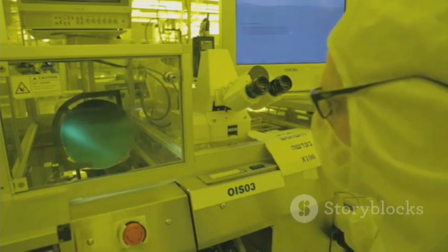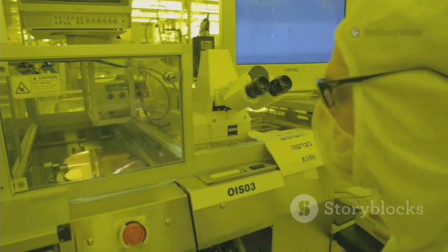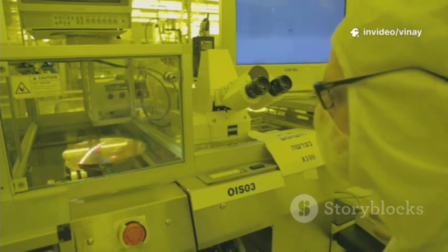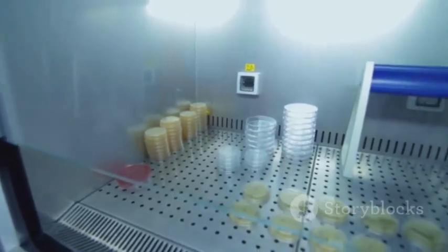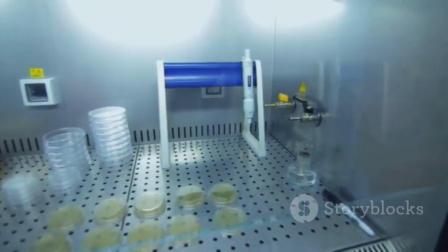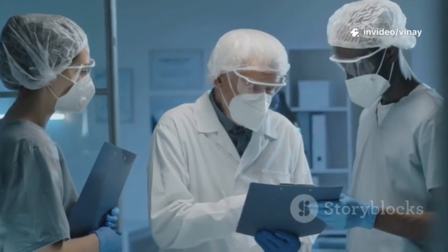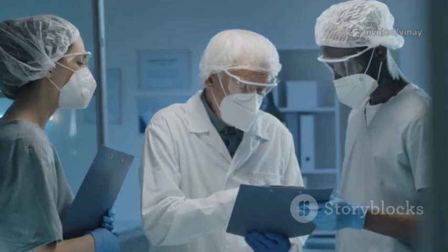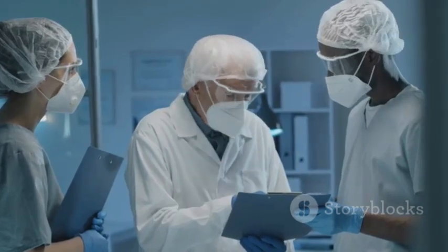Sterilization cycles must be validated, filter integrity must be tested for every batch, and suppliers of raw materials and components must be qualified to ensure they meet stringent quality standards. Every material entering the sterile path must have a certificate of sterility or be subjected to a validated in-house sterilization process. To manage these risks systematically, the US FDA encourages the use of formal risk assessment tools, such as failure mode and effects analysis, or FMEA.